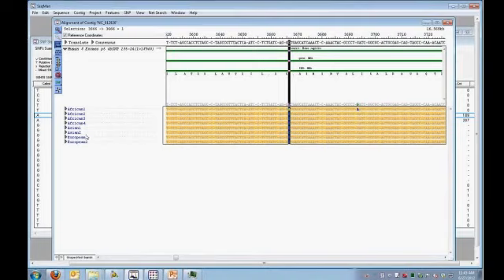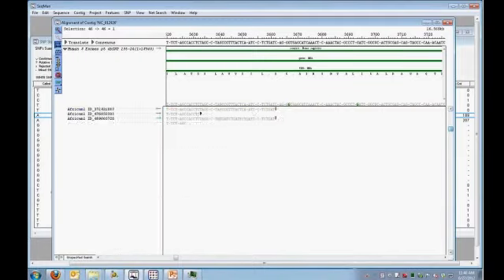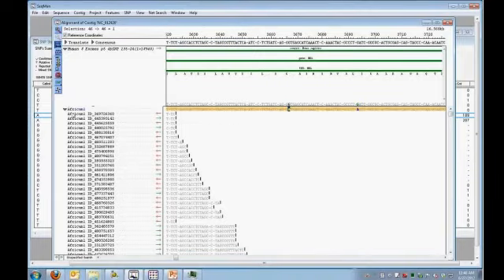And what I have collapsed here, here's my 8 exomes, and I can see these yellow highlighted regions are what we call a pseudo-consensus. And it's not a true consensus, but it's showing me the variant call in a collapsed form. So I can quickly see that the SNP that I've highlighted only occurs in the first African individual. And then, of course, the great part is I can expand this by clicking and a little bit of adjustment here, and I can actually look at the assembled data. So it's an excellent view, and the capacity is tremendous.